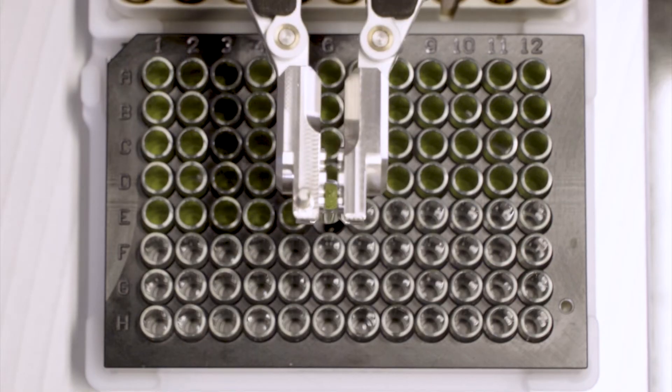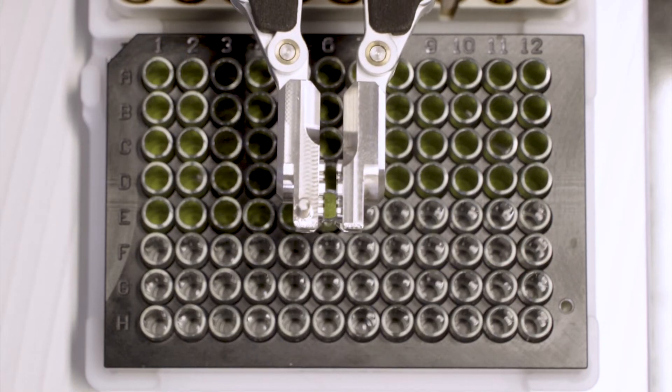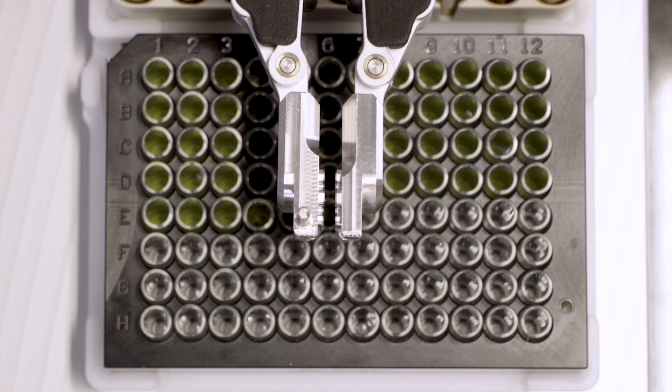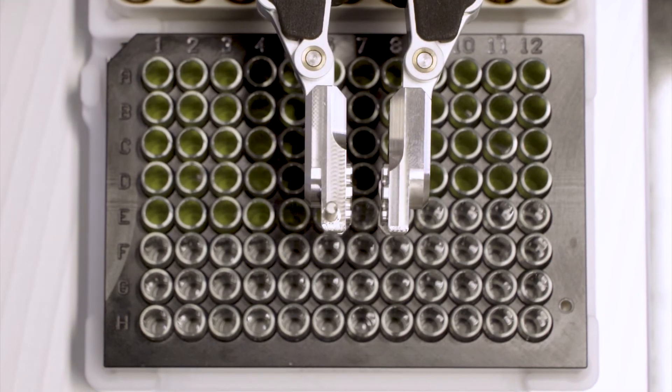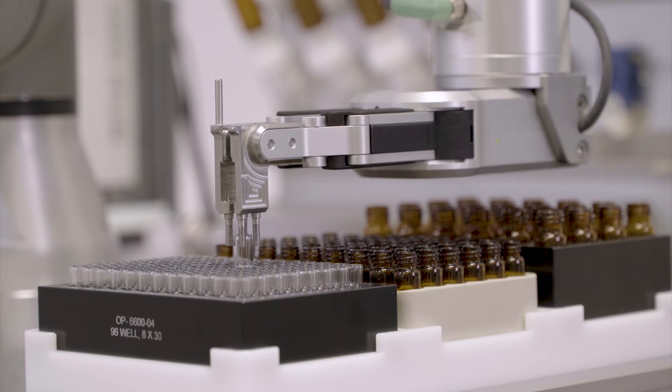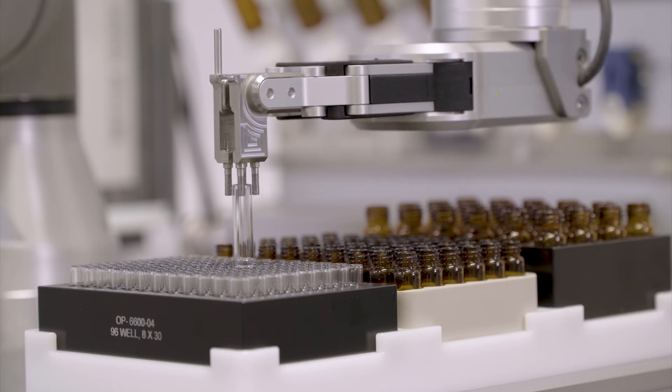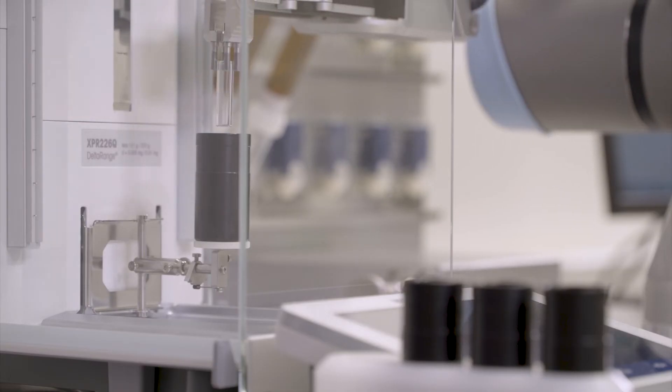A 96-vial plate can be dispensed in two and a half hours or less. The Cronect XPR can prepare up to 288 samples in one run.